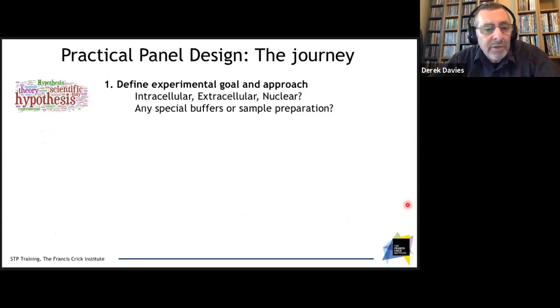So, how do we do it? What's the approach? What's our journey? It's always going to start actually by sitting down and thinking, rather than just going to the fridge and seeing which antibodies you have. You need to define the biological question that you're going to ask.